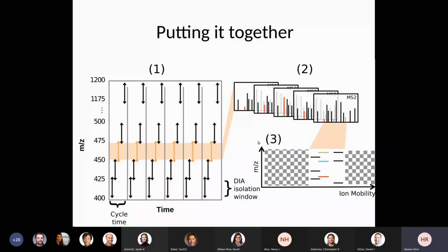The expectation is that ion mobility allows us to separate out fragment ions that are grouped together but originate from different precursors with different collisional cross-section. This would allow us to re-establish the link between which fragment ions come from the same precursor and which are background fragment ions derived from a different precursor, shown in black here. So this is one of the first jobs that we thought ion mobility would do for us.